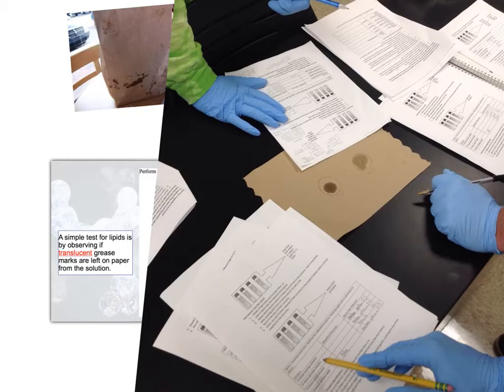Now there is another test that you could do. It's called the Sudan IV test. Because fats and lipids are nonpolar, they're going to dissolve in nonpolar solvents such as ether, methanol, ethanol, basically those substances that are not water. If you've seen salad dressing, you know that oil does not mix with water at all. Okay, it's very hydrophobic.